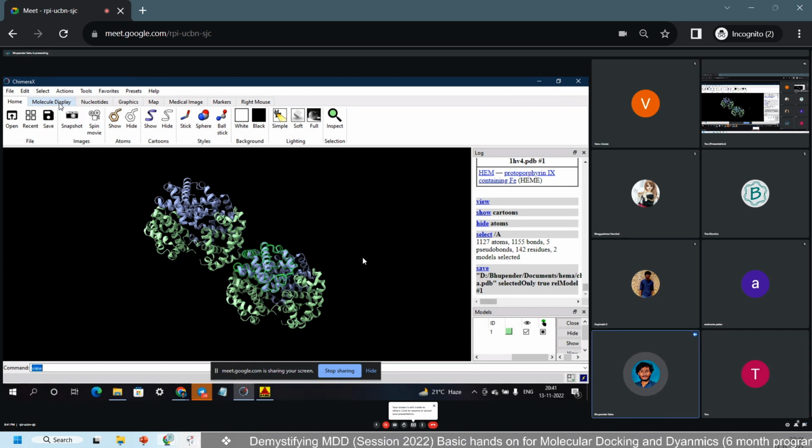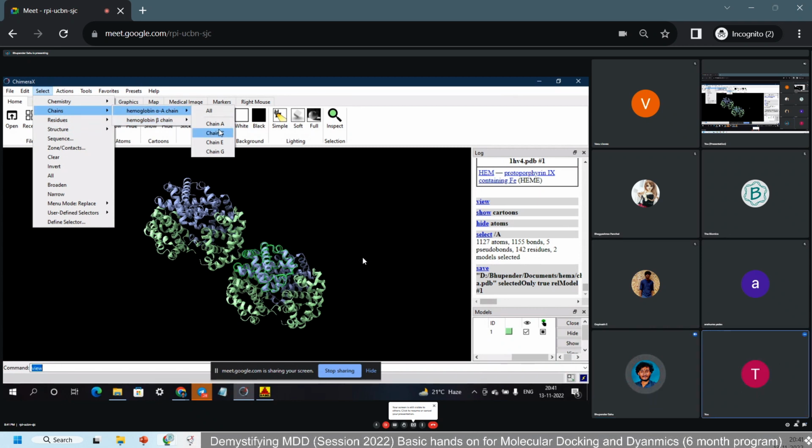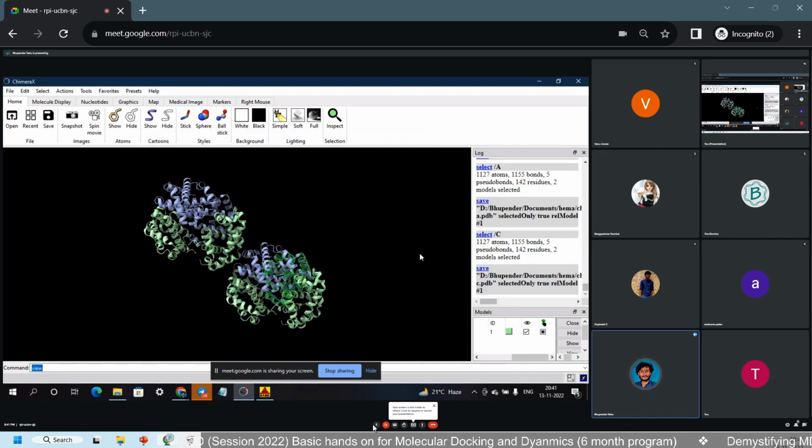Okay, sir. For the next, I will go to chain again and select the other chain, chain C. And the file save. Chain C and this. Yes, same, sir. Okay, now you can use the close option and load those two files.